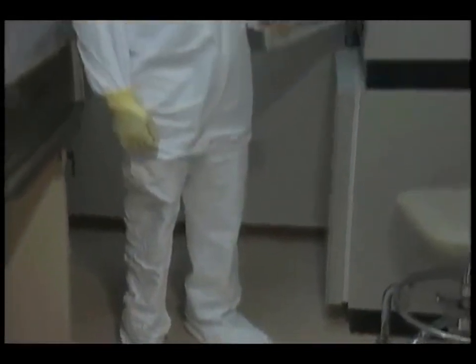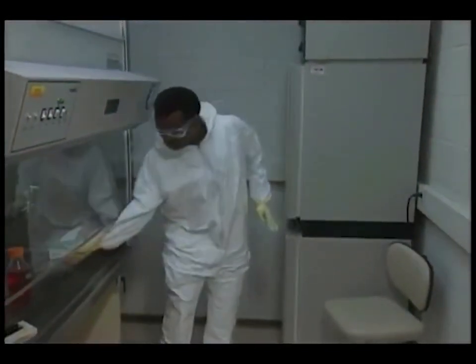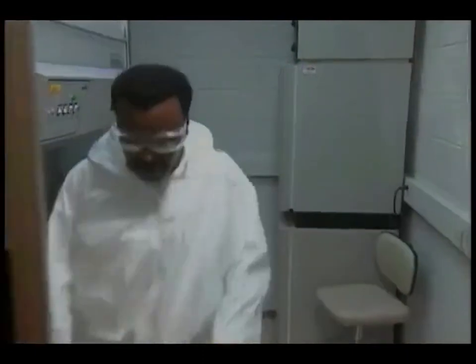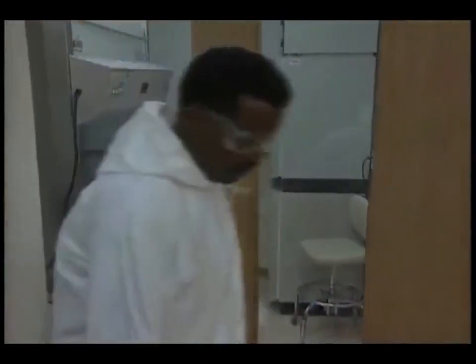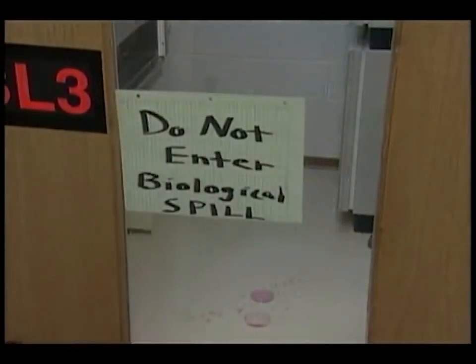A spill of an airborne pathogen, like Mycobacterium tuberculosis, calls for extreme caution. Hold your breath. Leave the laboratory immediately and remove protective clothing in the anteroom. The laboratory should not be re-entered for at least 30 minutes. Cleanup should be left to safety personnel.